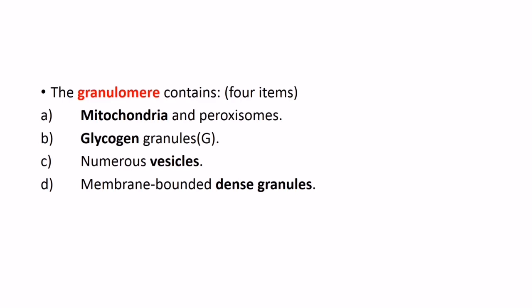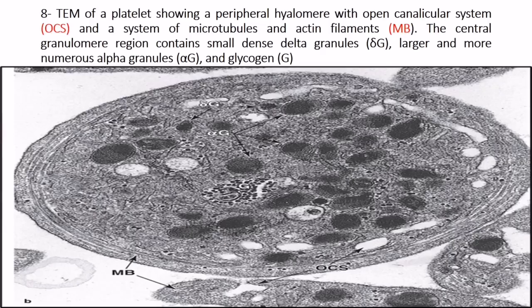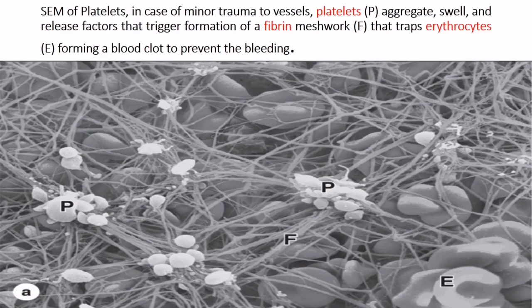Here is a transmission electron microscope image of a platelet showing the peripheral hyalomere with an open canalicular system and a system of microtubules and actin filaments. The central granulomere region contains small dense delta granules, larger and more numerous alpha granules, and glycogen.